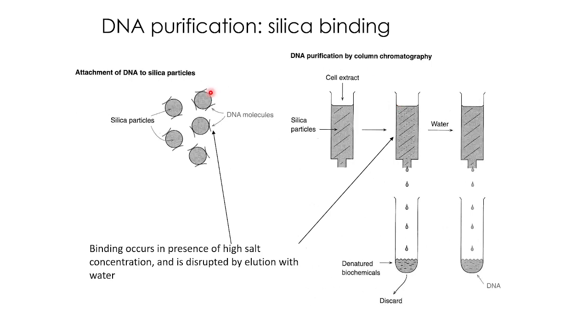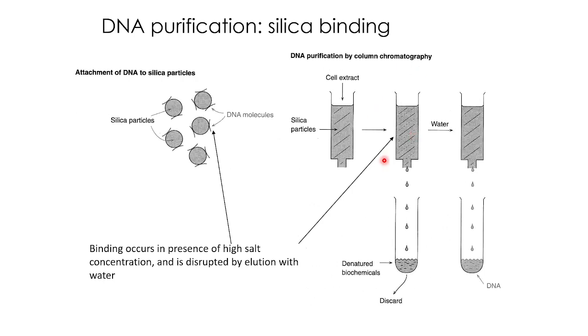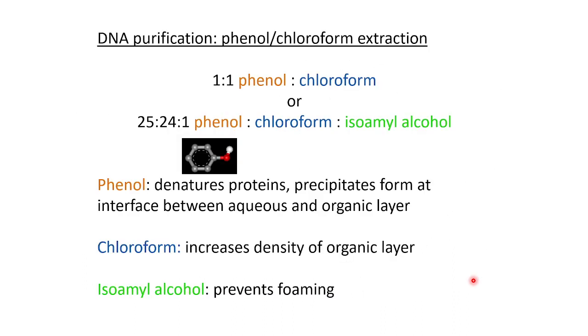So you take the supernatant and load it onto the silica columns, and you wait for say 5-10 minutes, and then you elute with water. So this is your DNA. Whatever DNA is there will bind to this column, the other things get discarded, and when you elute with water, you get your DNA. You can check the concentration and use it.